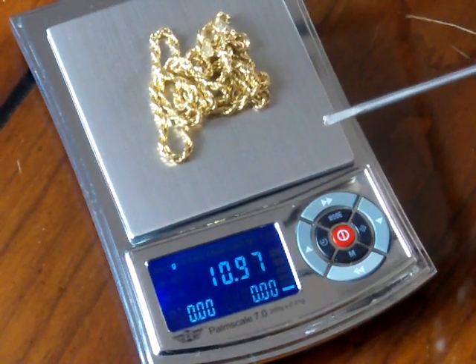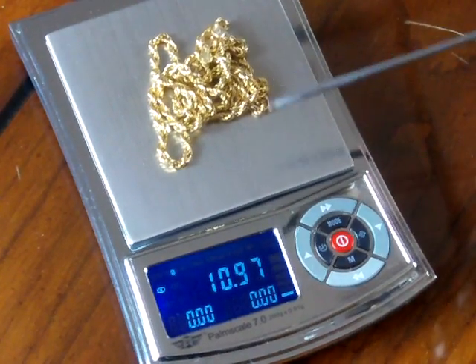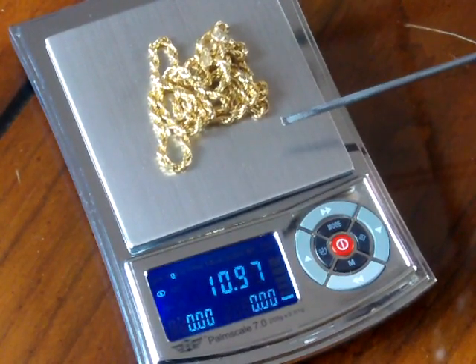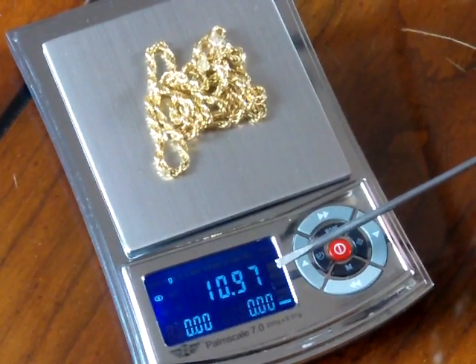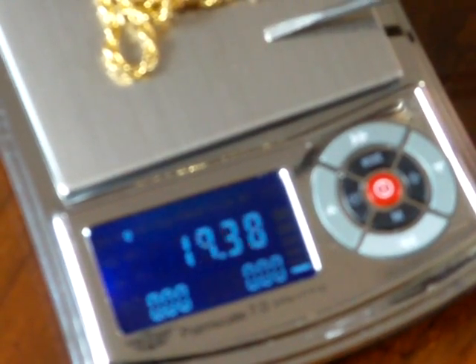We made a video on the POM 7, and that unit was 700 grams but it only went to a tenth of a gram. The scales look identical and features are pretty much identical, but the difference is this one has lower weighing capacity — only 200 grams — and ten times the resolution, going to .01. If you need higher weighing capacity, you'd probably want the PS7 which is 700 grams — more than three times the amount — but you would only have a tenth of a gram resolution.